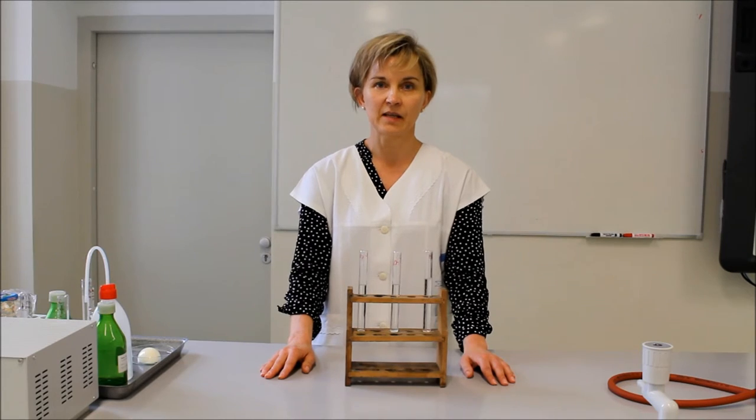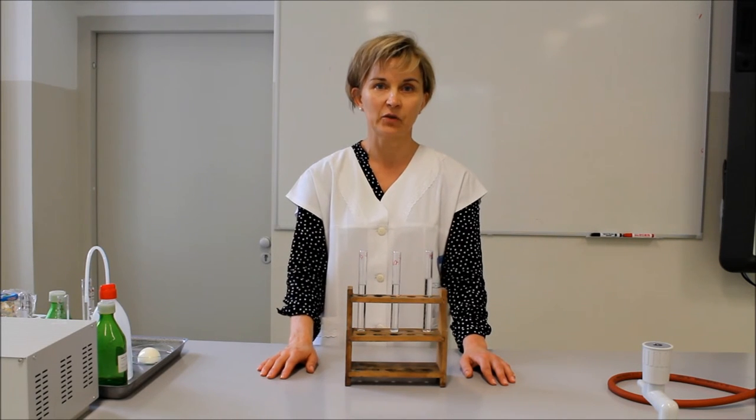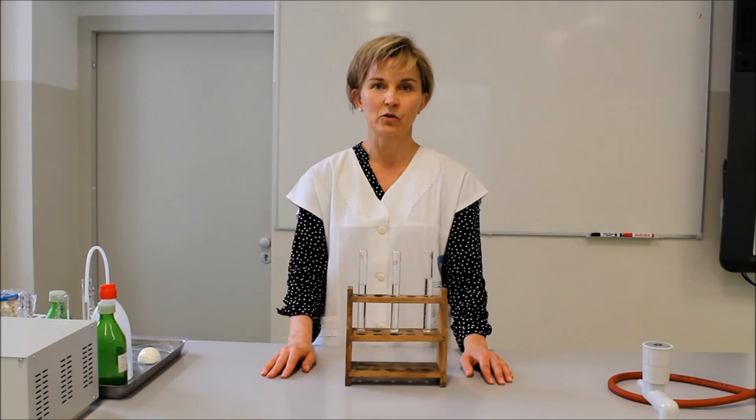A pepszin, ha változik a környezet kémhatása – vizes közegben semleges, lúgos közegben, azaz nátrium-hidroxidos közegben – ezekben nem fejti ki a hatását, ezért nem történt a fehérjével változás. A 37 fokos vízfürdőbe azért kellett tenni az oldatainkat, mert ez modellezi az emberi test hőmérsékletét, 37 Celsius-fokot, ami optimális ahhoz, hogy az enzim kifejthesse hatását. A pepszin a gyomorban termelődik – ennek előanyagát, a pepszinogént a fősejtek termelik a gyomorfalban. Ez bekerül a gyomor üregébe, és a sósav hatására aktiválódik pepszinné.